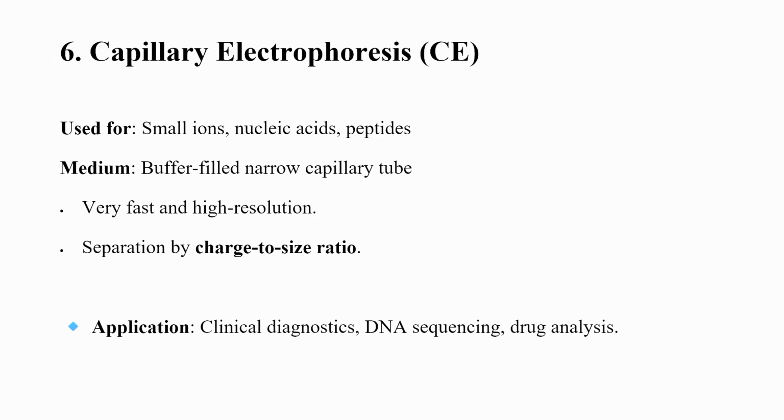Next comes capillary electrophoresis. Here it is used for small ions, nucleic acids and peptides. Medium is a buffer-filled narrow capillary tube. It is very fast and high resolution, and separation here is based on charge to size ratio. Application is in clinical diagnostics, DNA sequencing and drug analysis.